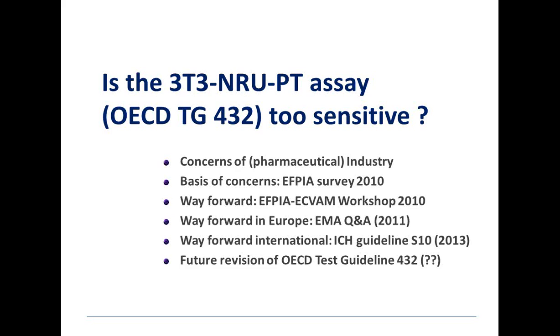Okay, so I will talk a bit about the concerns of the pharmaceutical industry, and that is a bit different to the cosmetic industry, where the two-tiered approach that Alison has just mentioned nicely is almost established in most companies that are using ingredients that may be phototoxic or contaminated with phototoxins due to their botanical origin.